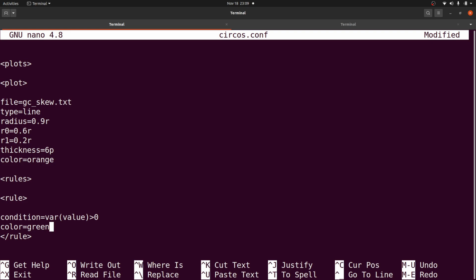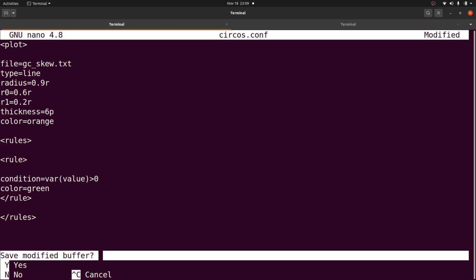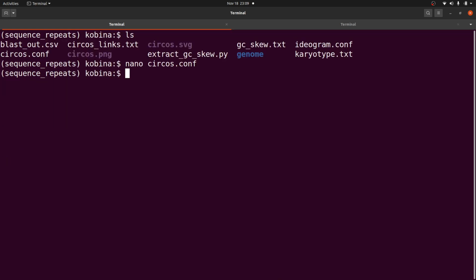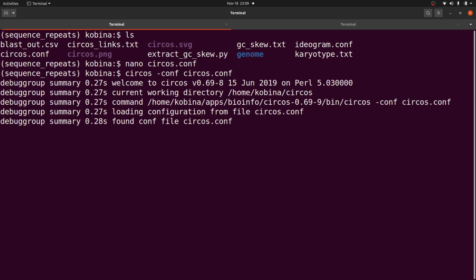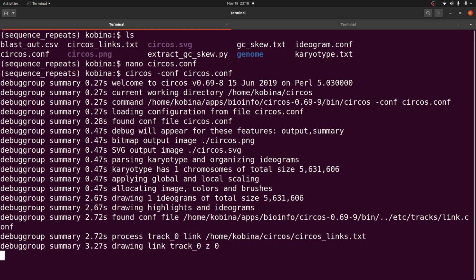All right. Once we are done with this, we need to make sure that the blocks are okay. Everything is fine, so you can exit and save changes. Then we can rerun Circos. I'll say circos.conf. Let's execute this command. Nice, now everything has been done. We are good to go.